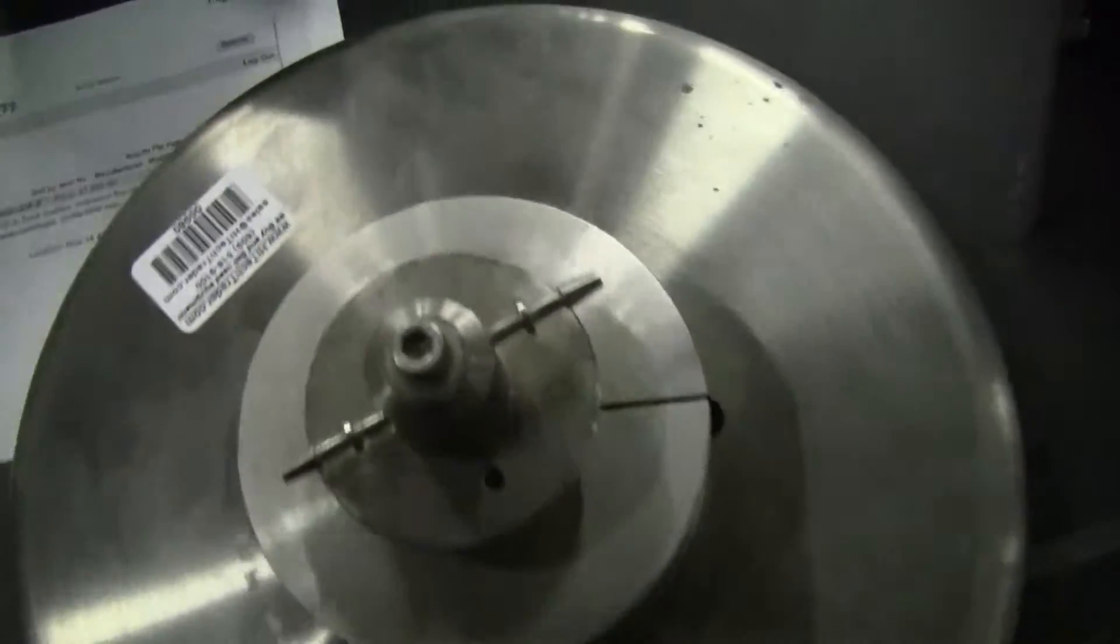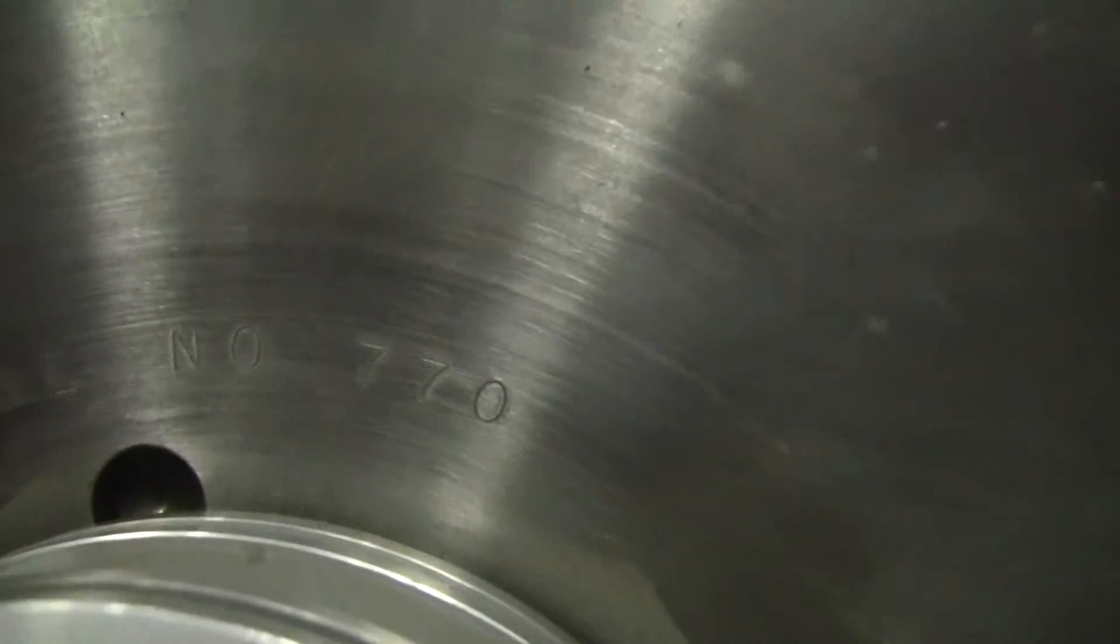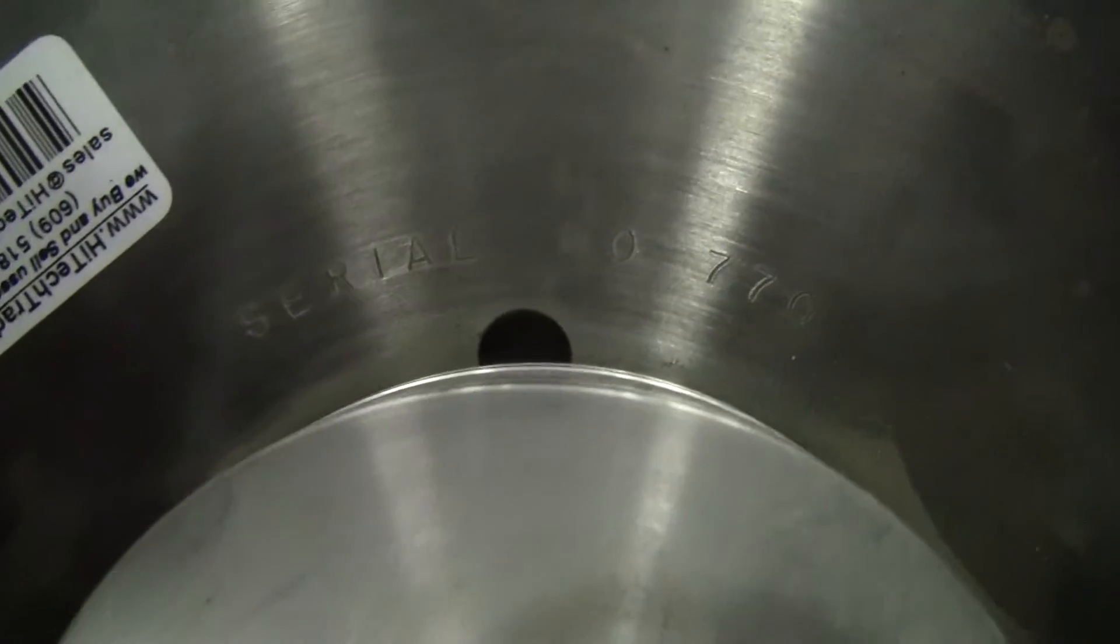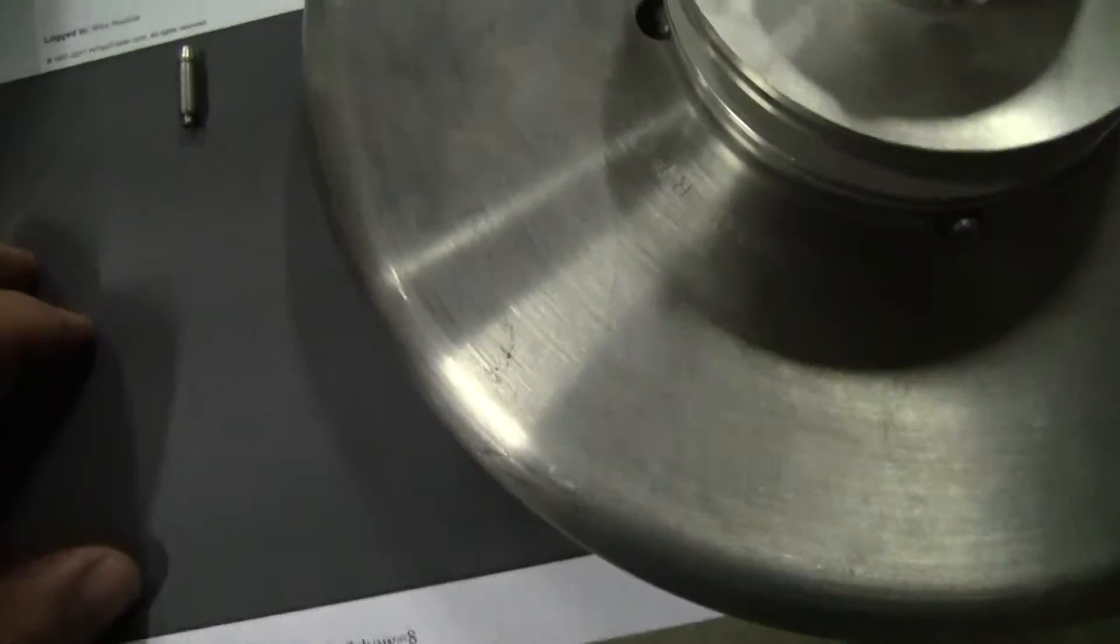The serial number of this particular unit is number 770. Just some pieces, I've never actually operated one of these rotors before.